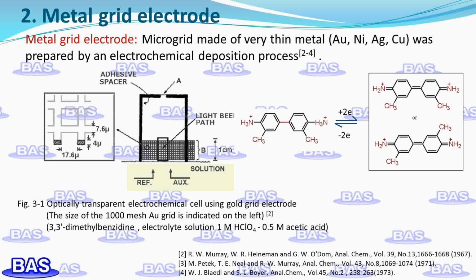The bottom opening of the thin layer cell allows contact with sample solution, reference electrode, and counter electrode. Suction is applied at A to refill the sample solution below into the thin layer cell. For this design, the internal solution can be easily refilled. It is characteristic of the spectroelectrochemical flow cell currently used. The electrode B is the conductive connection terminal. The measurement of the spectral changes during the oxidation of 3,3'-dimethylbenzidine was successfully performed using this thin layer cell. The time course of the absorption at 438 nanometers was recorded.